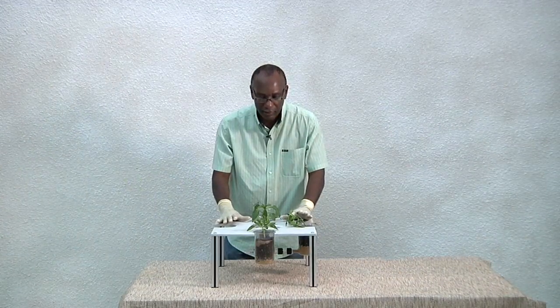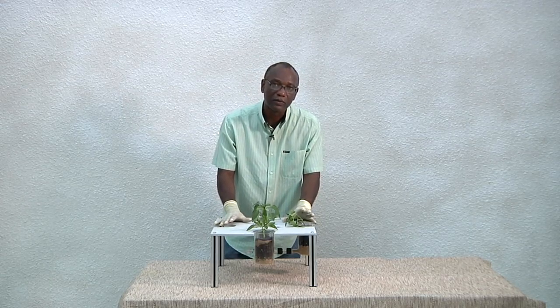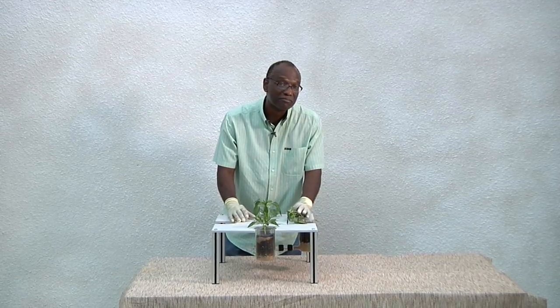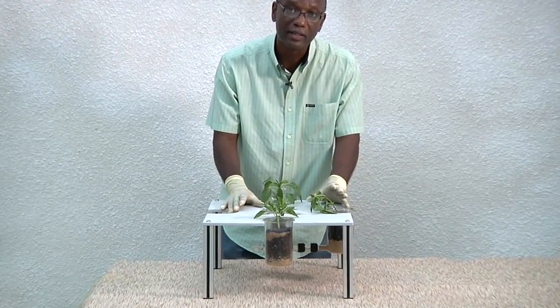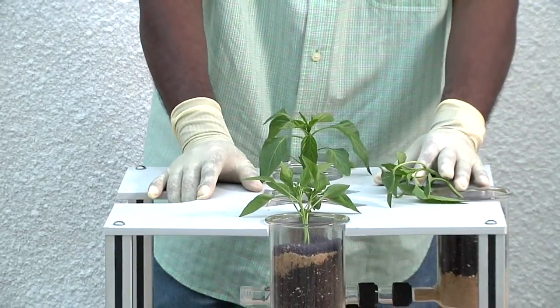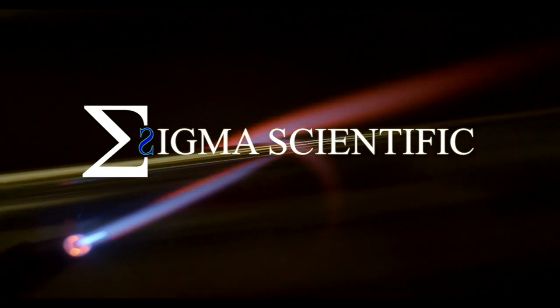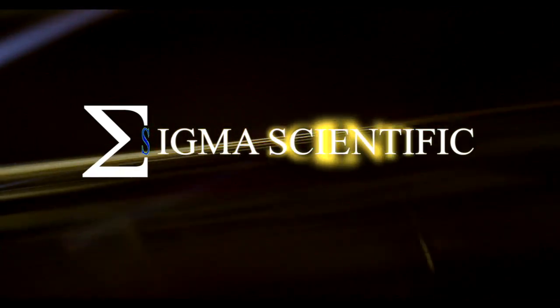This is the beauty about the soil olfactometer — you can use it for various arthropods, not just nematodes. Beetles, small insects that you find in the soil. It's a fascinating apparatus. Give it a try. Thank you.